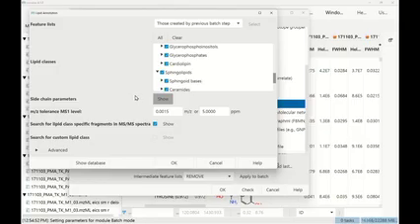Yeah, so far we don't have any standards or any data that we base it on. So we're using all the different databases or the fragment rules that are described in literature. And we also do detect if there's a potential collision. So if you're searching for PE and PC and so on, then different adducts might also collide. And of course, if you have a double bond, then the isotopes. So this is something that we flag in the table, and it would definitely be interesting to improve it even further. Yeah.